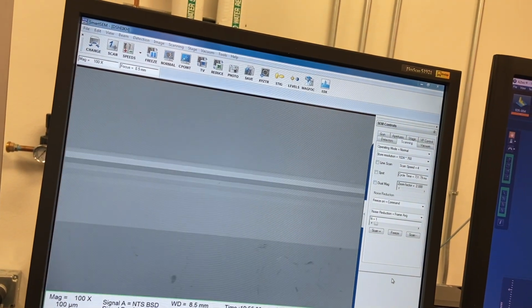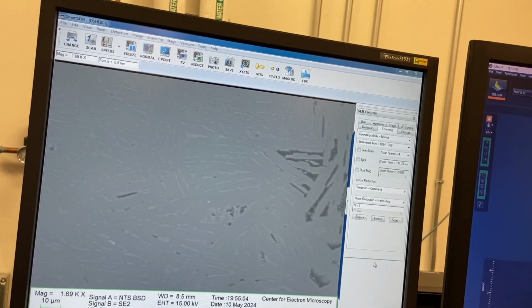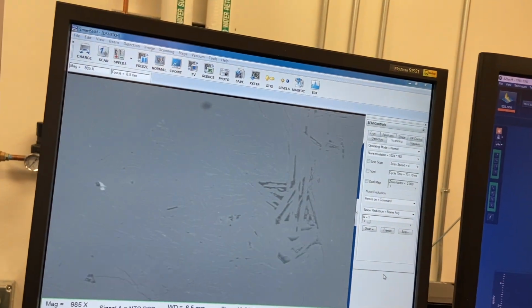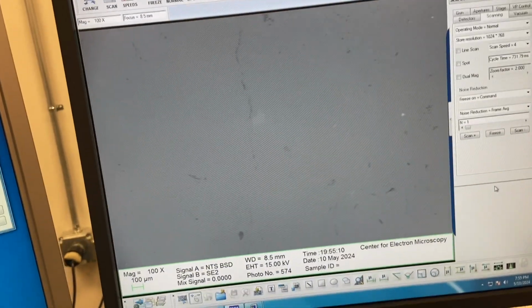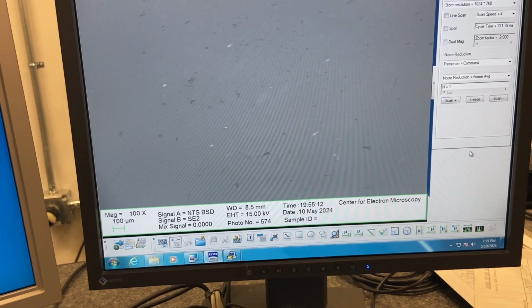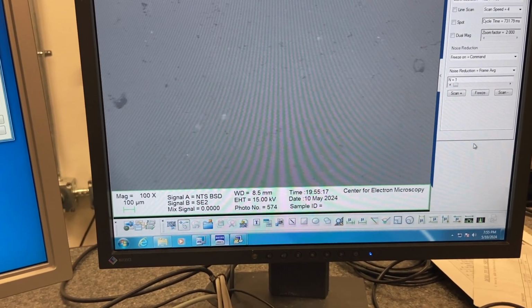And give it time to work. Okay. So let me do something like this. Actually, let me find a better area here. I think this area is a little hard to see here. Let me try this area.